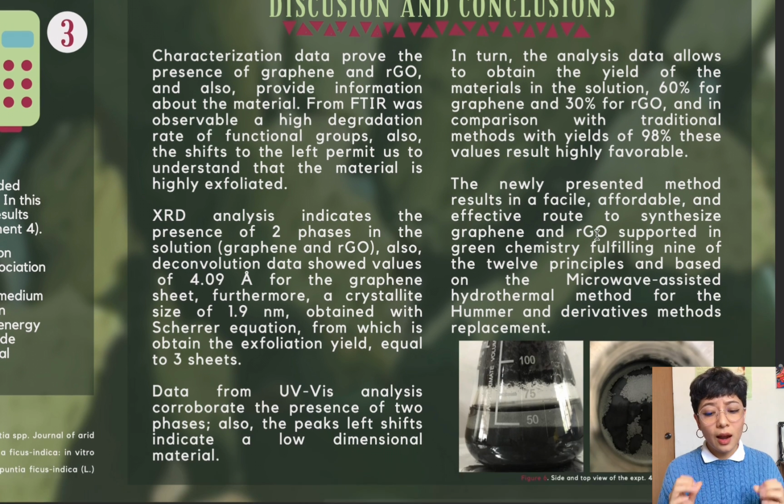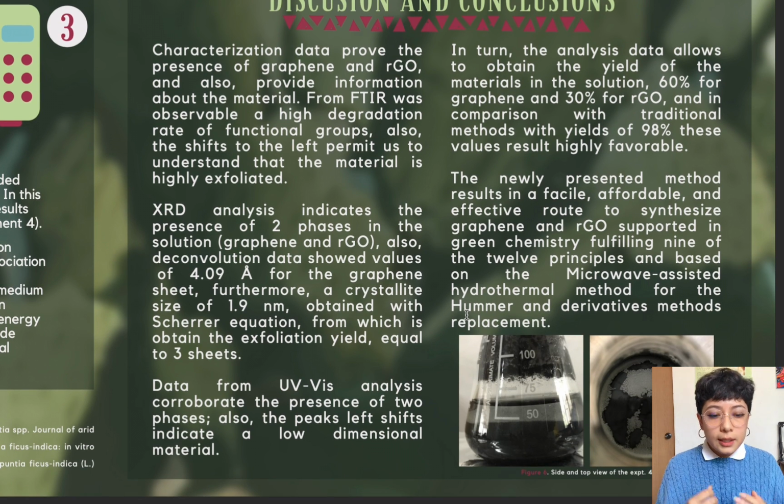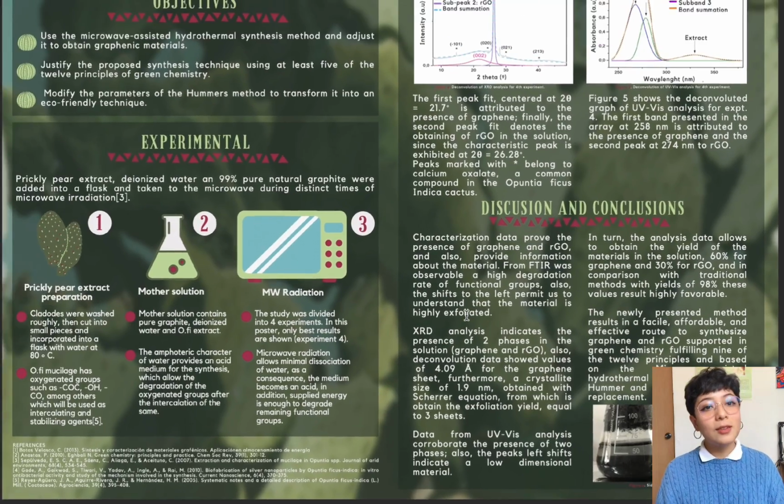The newly presented method results in a facile, affordable, effective, and overall scalable route to synthesize graphene and reduced graphene oxide, supported in green chemistry, fulfilling 9 of the 12 principles and based on the microwave-assisted hydrothermal method for the replacement of Hummers' and derivatives methods.